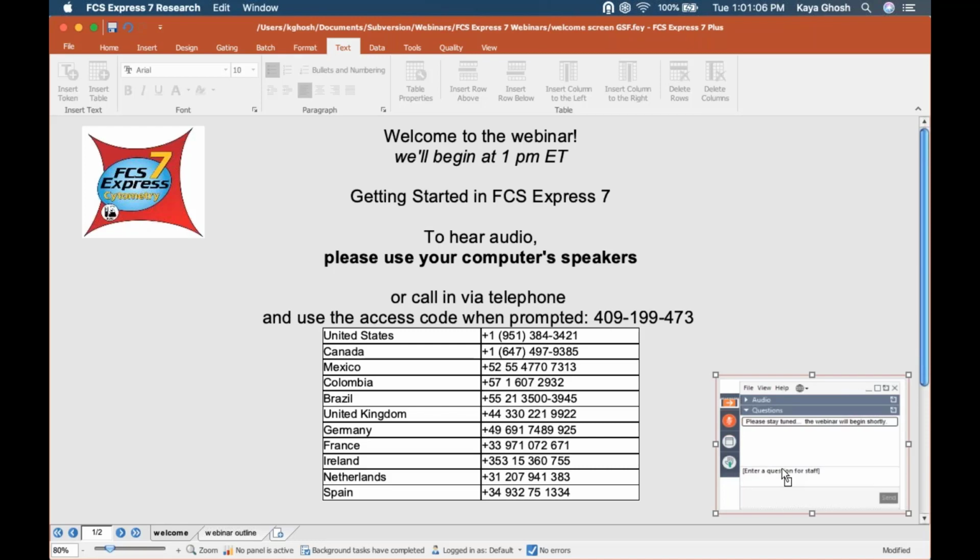Okay, so hopefully what I'd like to do is give you all an overview of how to use the software efficiently. If you have an experiment with 10, 20, or 100 or 200 files, you don't want to spend hours and hours analyzing that, right? So I'm going to show you a more efficient workflow that applies to a wide variety of experiments that you could possibly be doing.